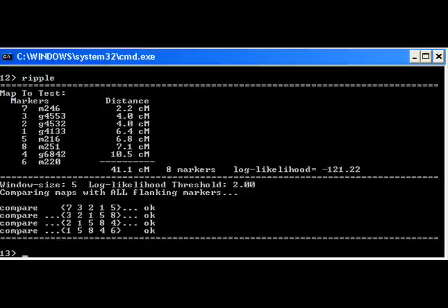The ripple command checks the map against a specific LOD criteria. The default criteria is window size is 5 and log likelihood threshold is 2. The command looks at 5 loci at a time.